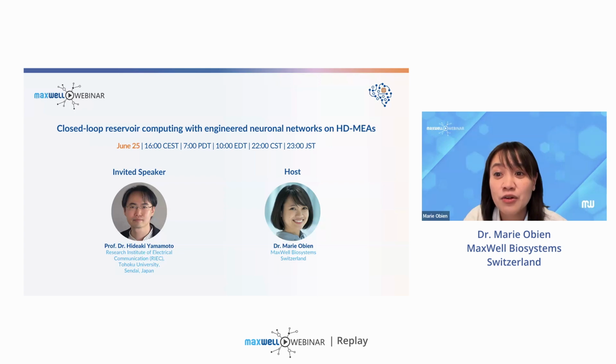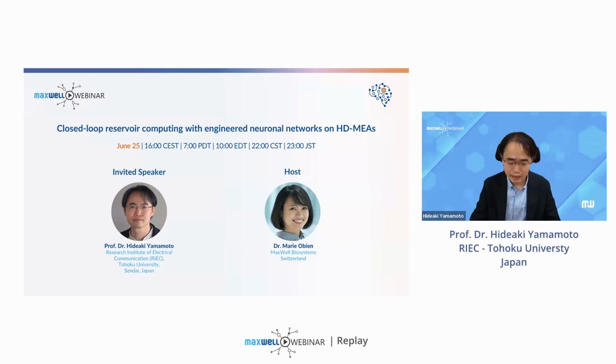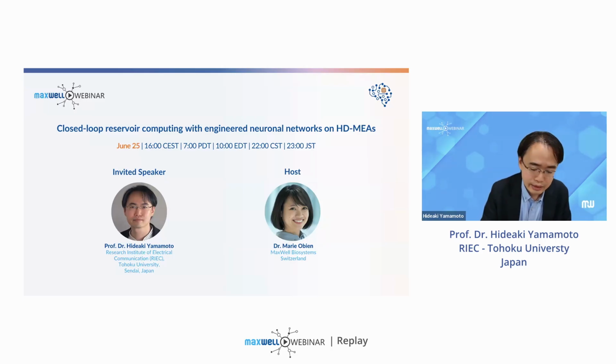How long do the networks retain the learned behavior after the training session? I'm actually curious about that. In closed-loop experiments, the learned response often fades shortly after training, sometimes within just minutes. And great talk. Thank you very much. As I mentioned in my talk, and also in the paper, there is what we call the free running mode, where we turn off the weight updates and let the activity self-sustain. This is still tricky, and it's not always that it works.